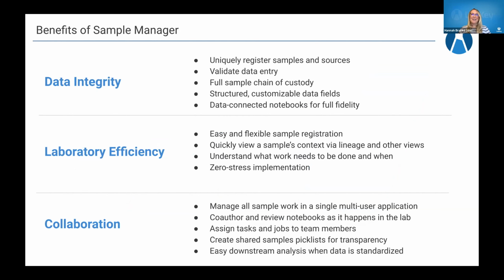We all know for those analysts that are on today, most of the work is data cleaning, so we're trying to reduce that for you as much as possible. Making sure that we're focused on that laboratory efficiency that Michael talked about. Again, as easy as we can make your life in the lab, the more science that you can do more efficiently, faster, and get the results that benefit our communities as a whole.